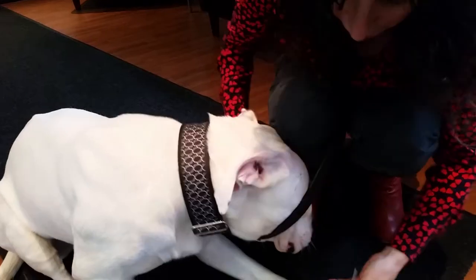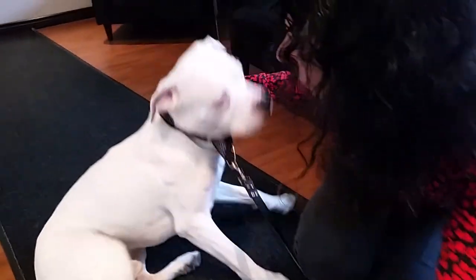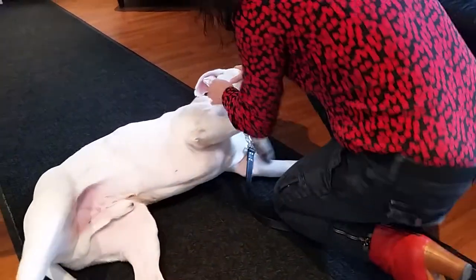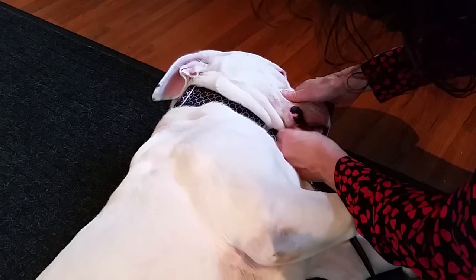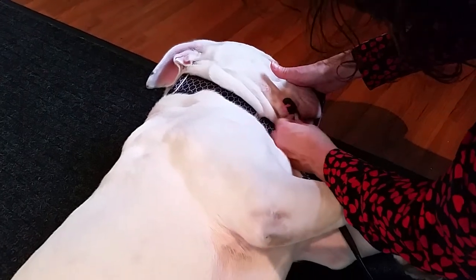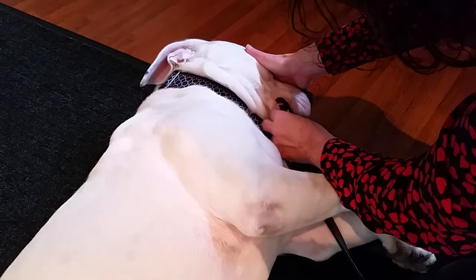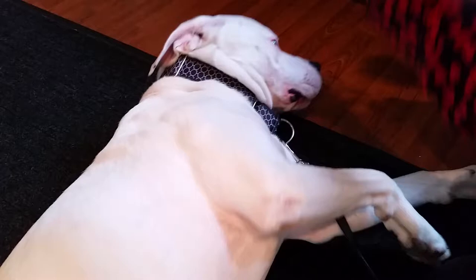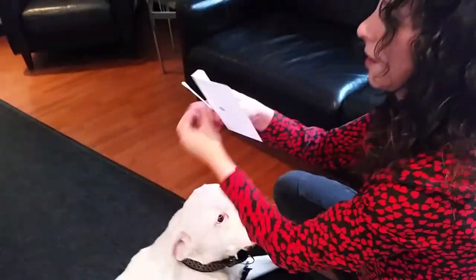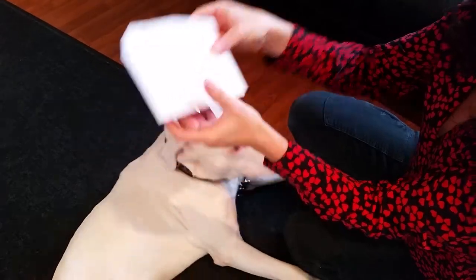Sometimes they don't like it, which is okay. If the dog doesn't like it, we find one of the best things to do is just get them down — it doesn't hurt them. Sometimes you can even cover their eyes and it immediately relaxes them. You're going to rub the inside of their cheek for 20 seconds, then take the first sample and let it air dry in the provided envelope.